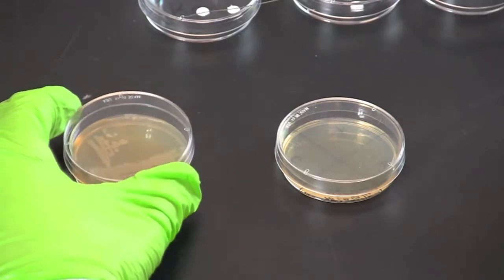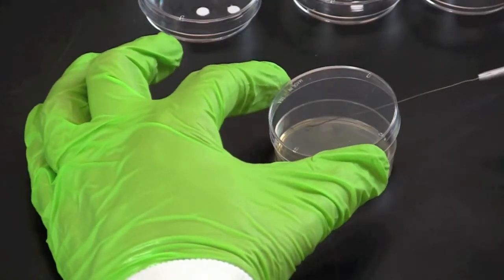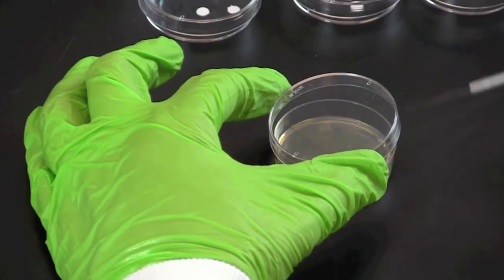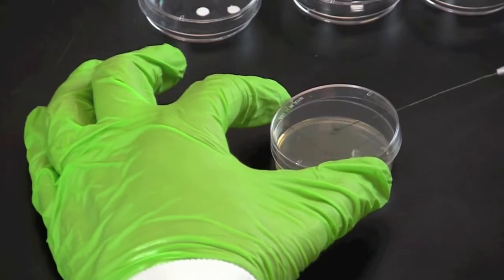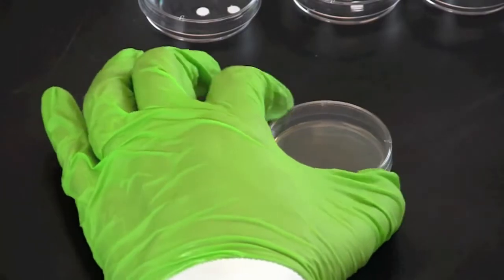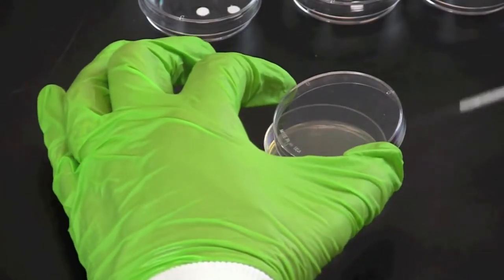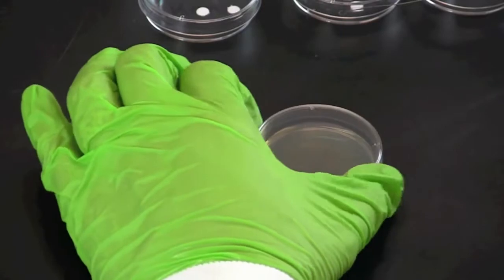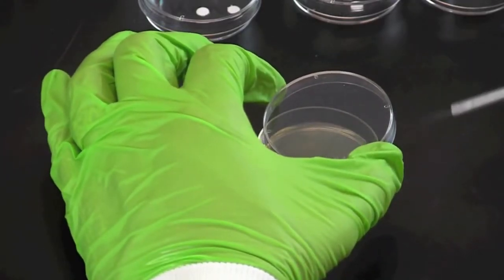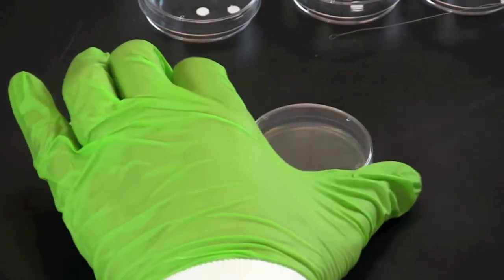Gently scrape the colony from the surface of the plate so that it collects on the loop. Transfer the bacteria to your prepared plate. Spread the bacteria over the entire surface of the plate in all directions. Rotating the plate a quarter turn between spreads will ensure that the bacteria is spread evenly across the plate.